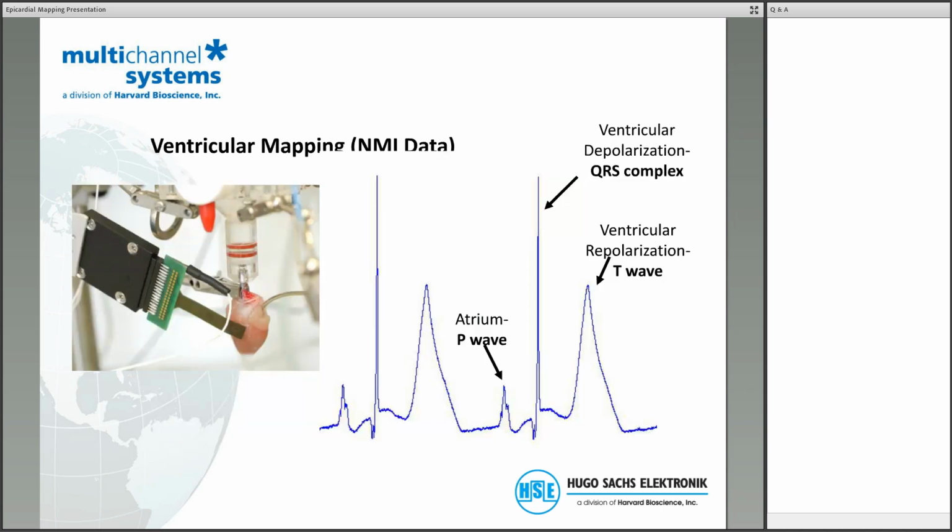And as that was probably a little bit too fast to really see the signals, I would like to show you typical recordings from the data done at the Natural Medical Sciences Institute. Thanks again to our colleagues at that institution that they permitted us to use this data here. So what you see here is a recording where we have the electrodes on the ventricle.